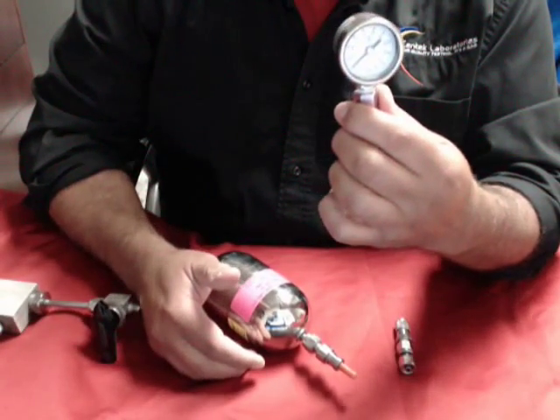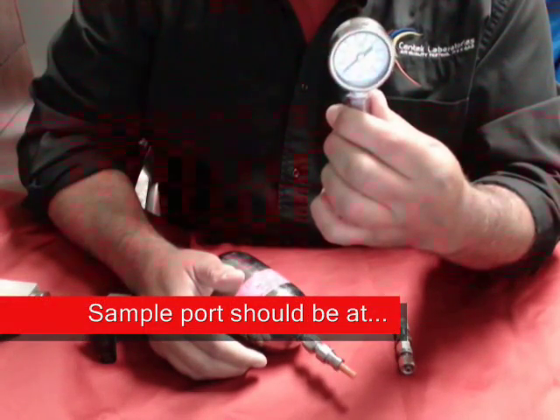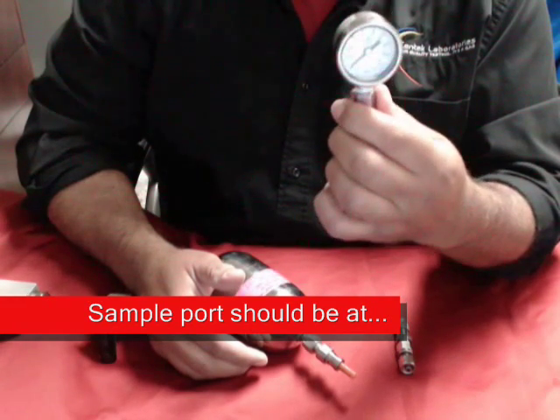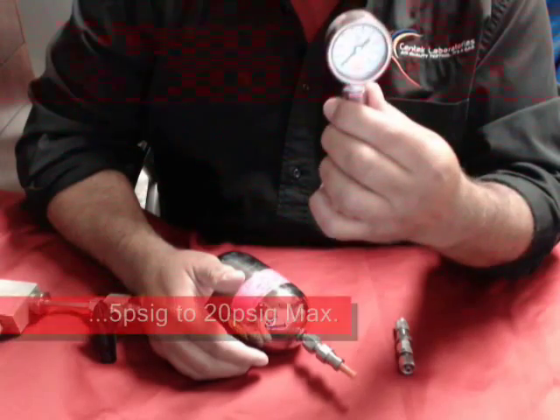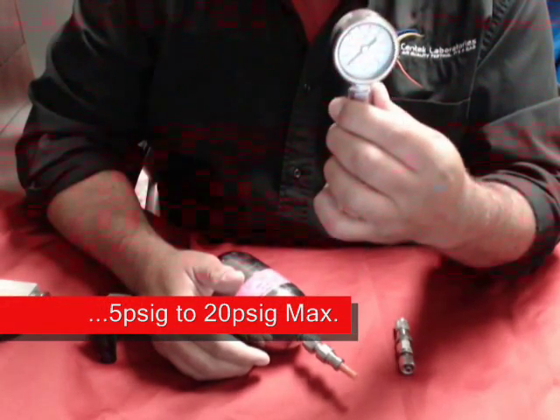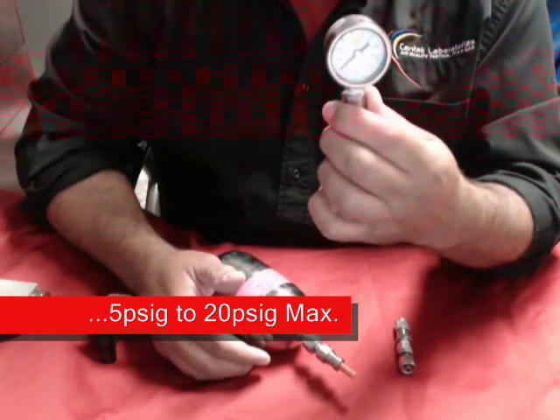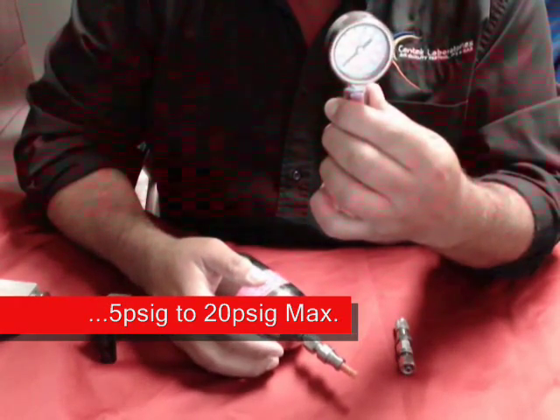The other thing you'll get is a gauge. The gauge will read vacuum and in most cases will also read positive pressure. When you're pulling your sample, please make sure the port you're sampling from is at positive pressure — it should be anywhere between 5 psi gauge to no more than 20. If it's higher than 20, we stand the chance of making our equipment not function properly.